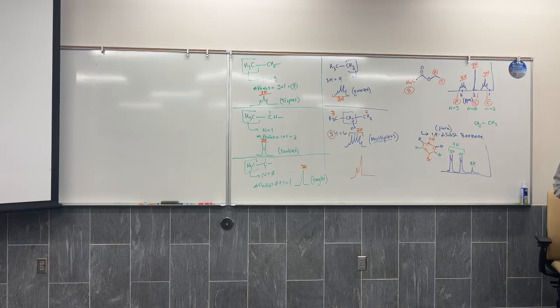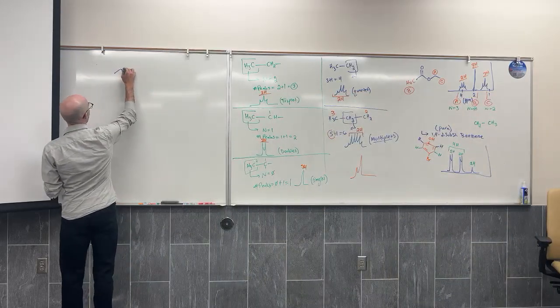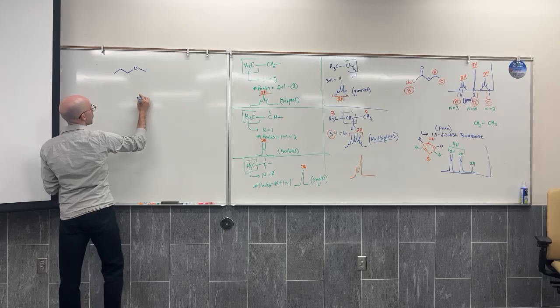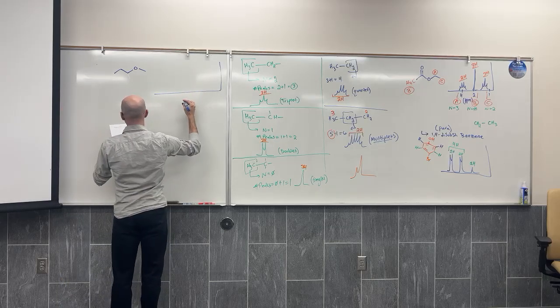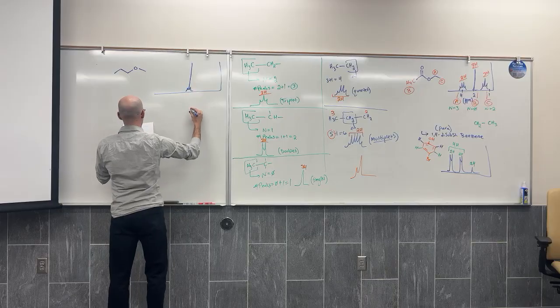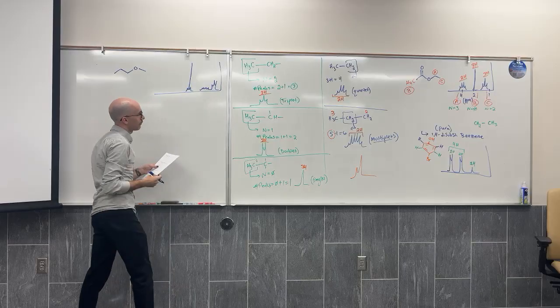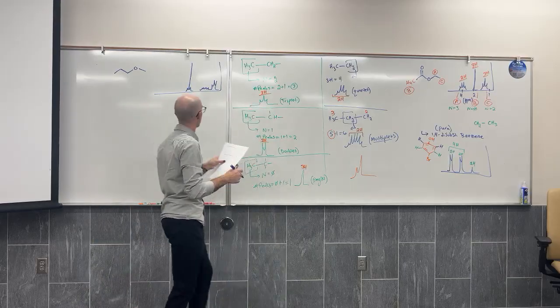All right, methyl propyl ether, which gives a signal that looks like this. Can we assign these integration values?